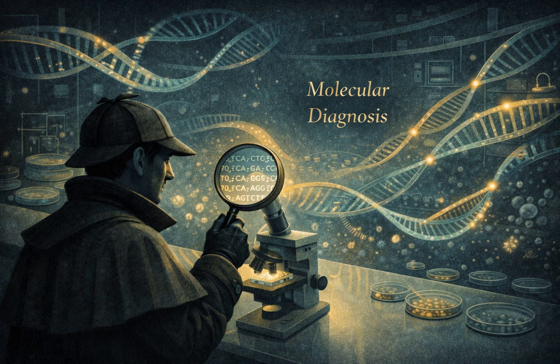Exactly. You'd then separate those fragments by size on a gel using electrophoresis. The smaller fragments move faster, the larger ones move slower. You'd end up with a unique pattern of bands for each strain. It looked a bit like a supermarket barcode. And there's a special version of this for really big pieces of DNA, right? Yes. For trying to compare entire bacterial chromosomes, you needed a technique called pulsed field gel electrophoresis, PFGE.